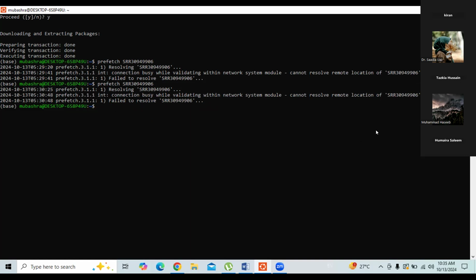First you need to create an environment. You have created your miniconda environment? Yes, I have. Okay. Can you please type the command? Let me type a command in the chat.